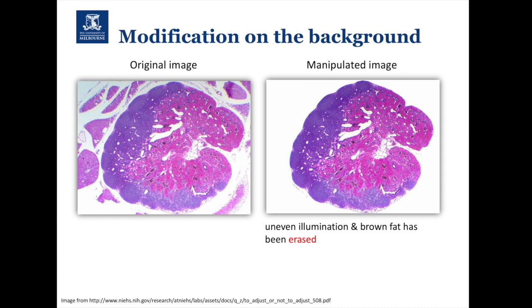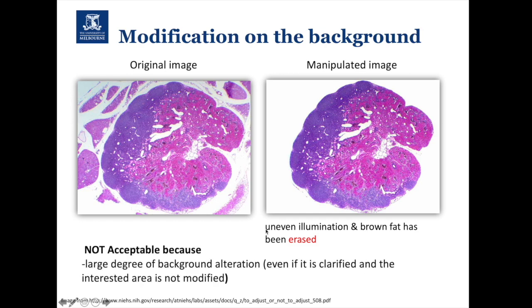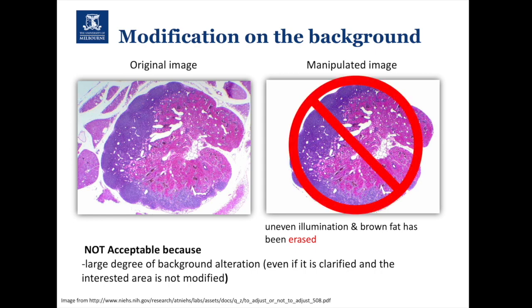Last one is we've got our original image on the left. There's a bit of uneven illumination again, and we've removed all of this background tissue as well. Again, not acceptable. We're taking a large degree of background alteration, even if it's clarified within the text. Unethical.